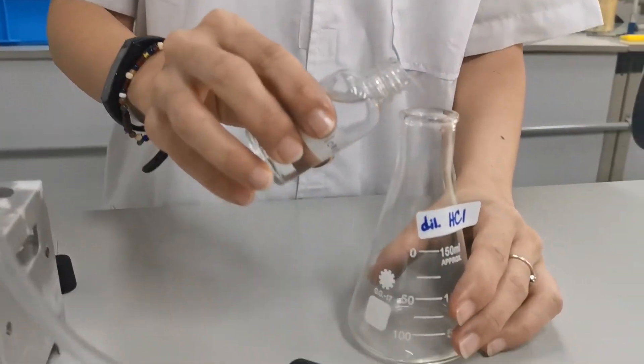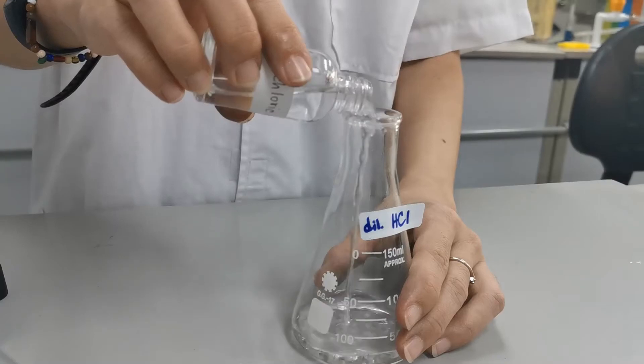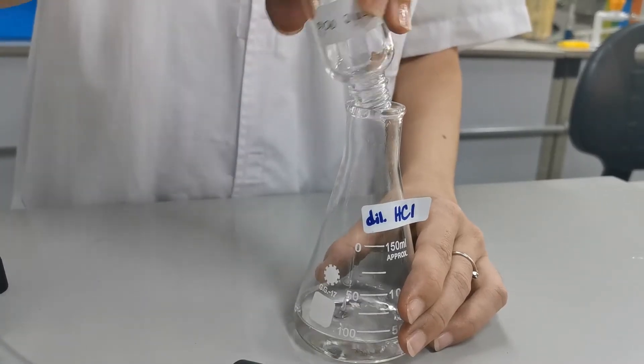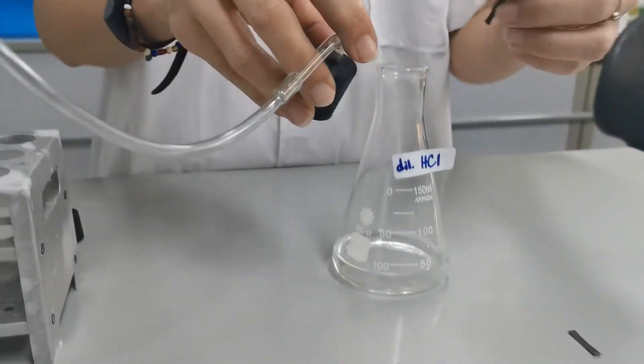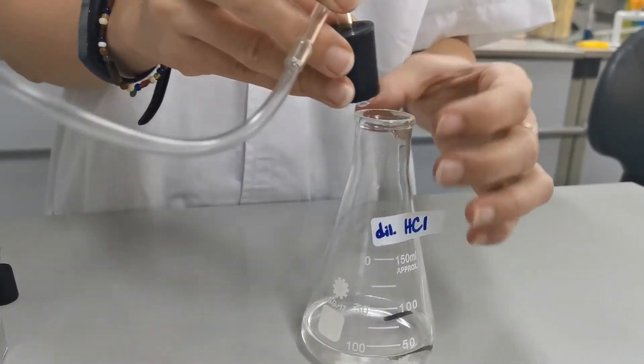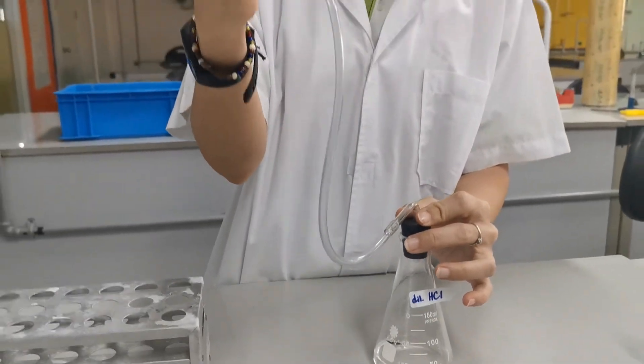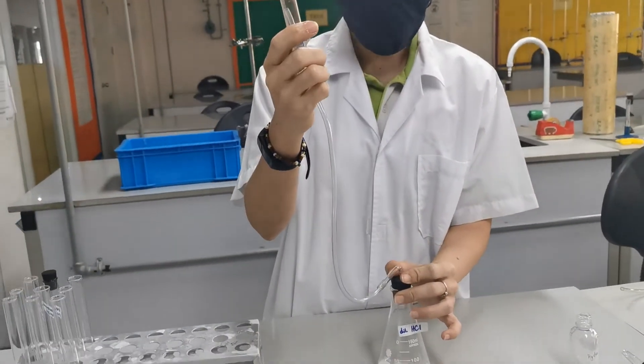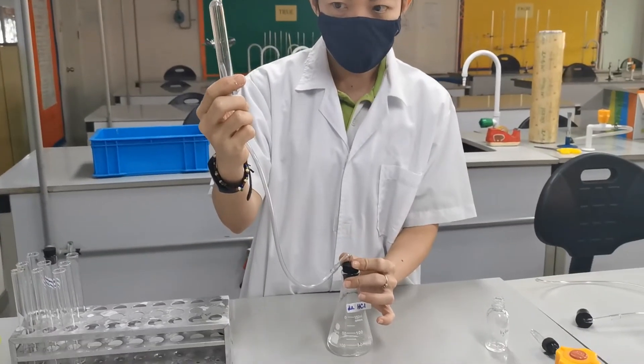I have here hydrochloric acid and then drop in a piece of magnesium ribbon and bring this upward like that. I'm hoping the hydrogen is going to collect in the test tube.